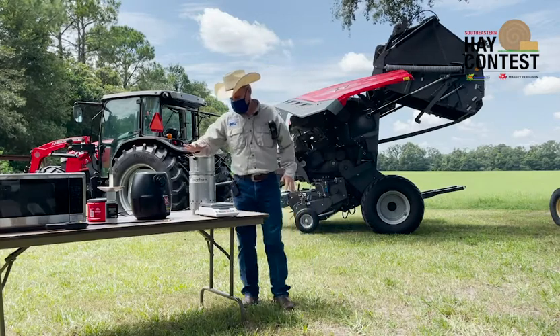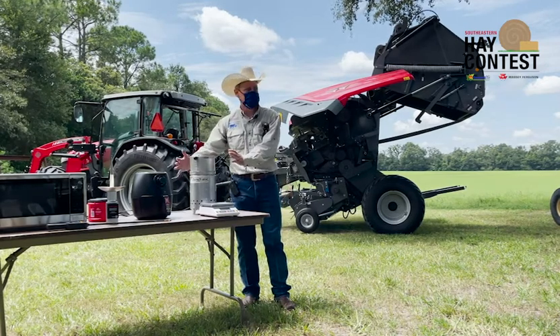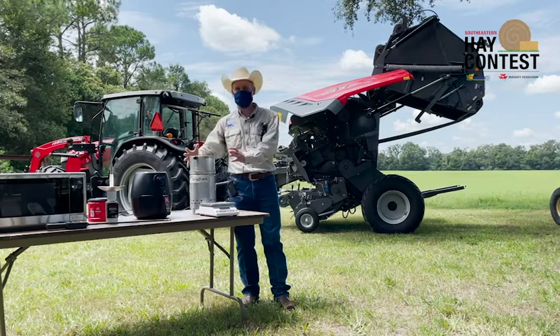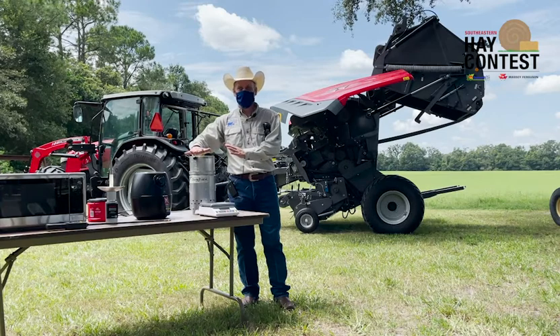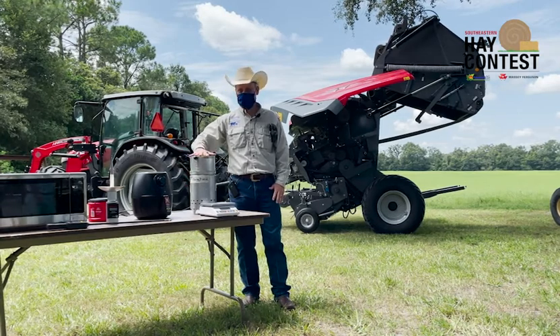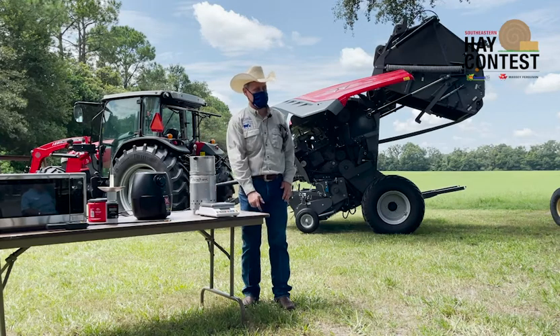This one here is a dedicated dryer. It's very accurate. But the problem is it's another tool you need just for the hay — something you'll have to store somewhere and might not find or could break. It costs about $400, so it's a little costly. But it will give you a very accurate measurement, and the procedure is straightforward: it's electric, it dries the sample, and you use the same weighing procedure we mentioned for the microwave.